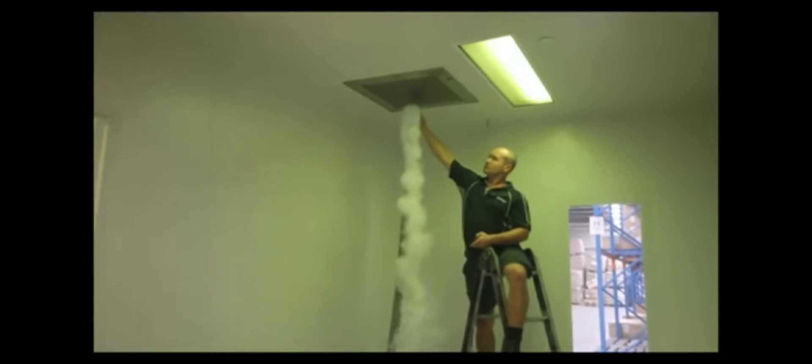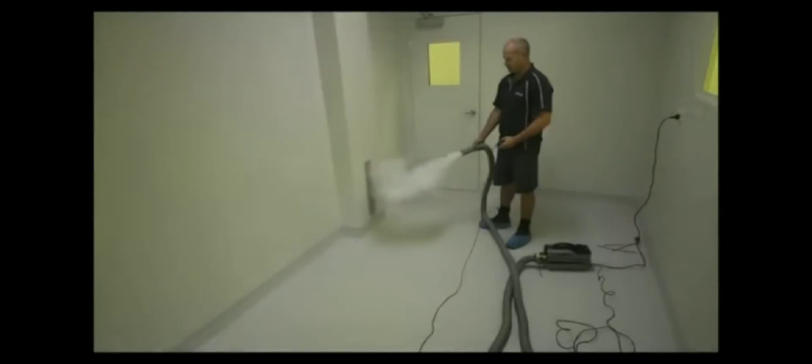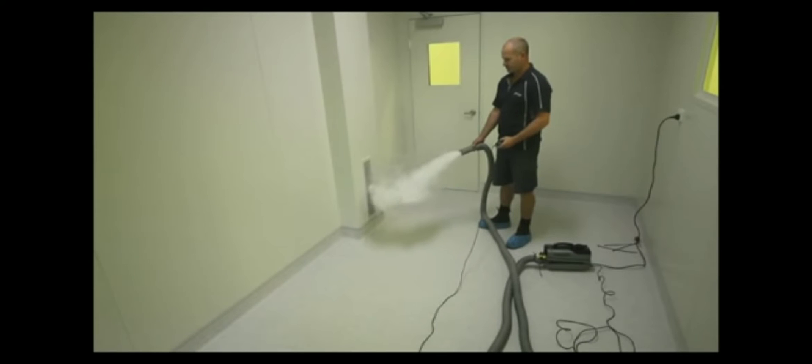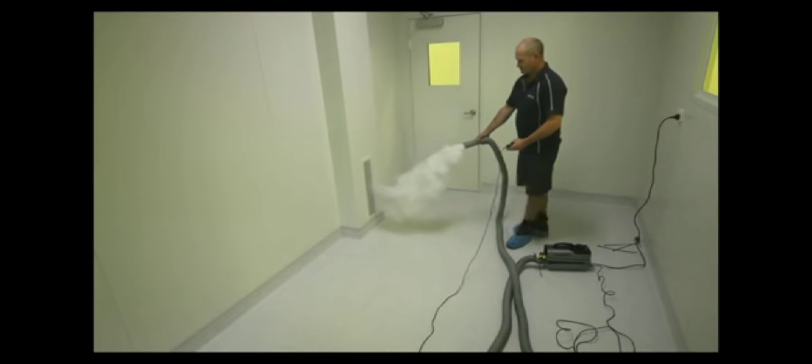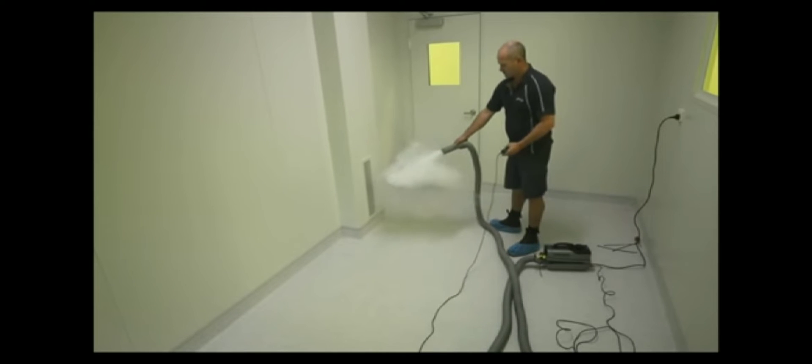What you will notice is we have turned the lighting down to get some shadows on the walls and we are using a nice crisp white smoke at a high density.